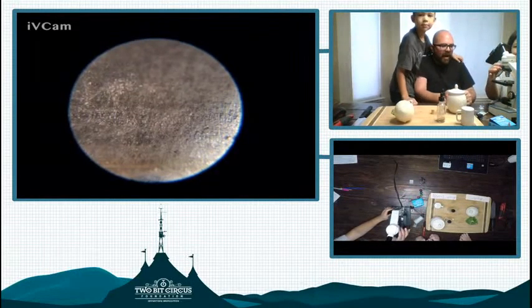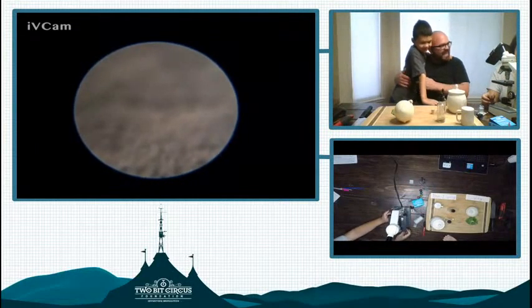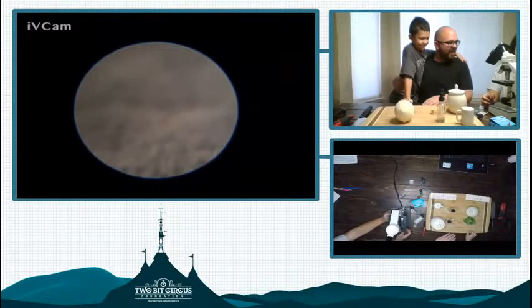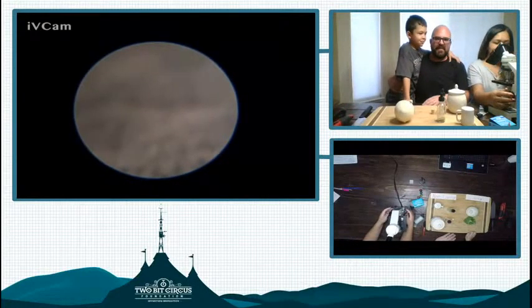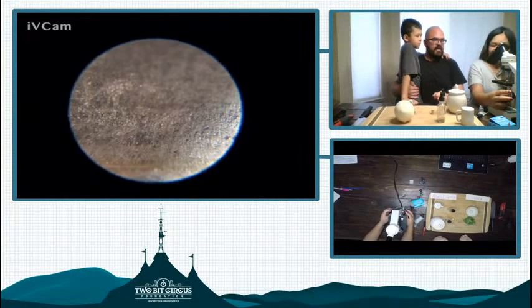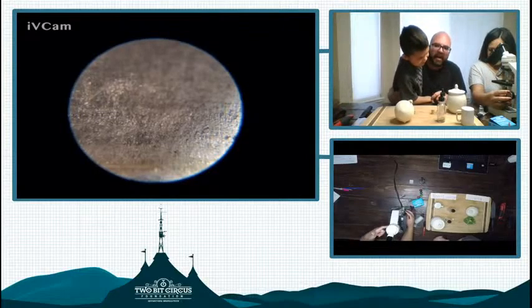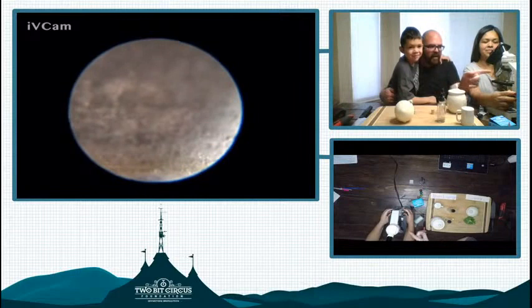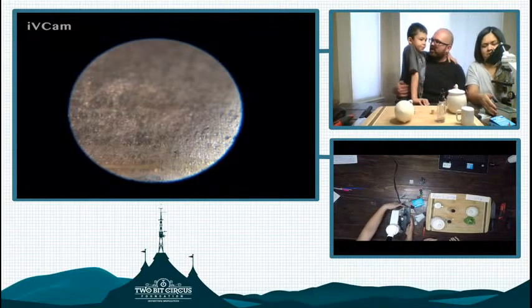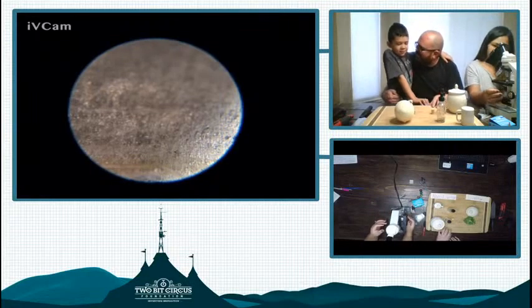Hey May, they could see you off camera hiding there. You might as well just say hello. Hello, everybody. So it looks like my stream got taken over. We've been hacked. The science teacher, the middle school biology teacher, was trying to show us how to use a microscope properly, huh? So tell us what you're doing there. Okay, so to use a microscope without breaking your slide, you need to make sure that you start at the lowest objective lens. These are called objective lenses. On the microscope, in the top right corner of the picture, there are these 3 lenses here. And what our teacher is telling us is that we could change them around to change the magnification, right? So we could get an outside look, and then we could zoom in, and zoom in, and zoom in, huh?